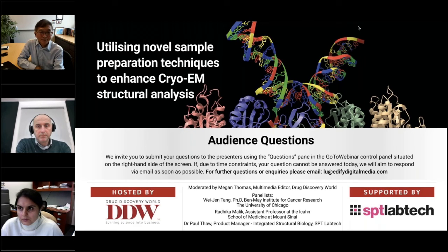But to be honest, we usually end up using spotiton on chameleon for our sample preparation because that's what we need to get the structure solved. So we usually don't have the luxury not to use it.